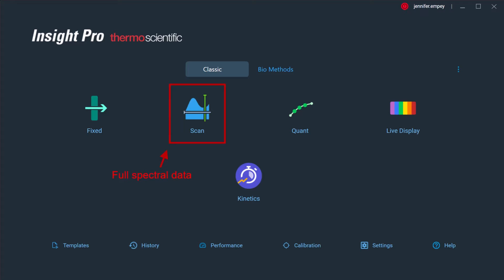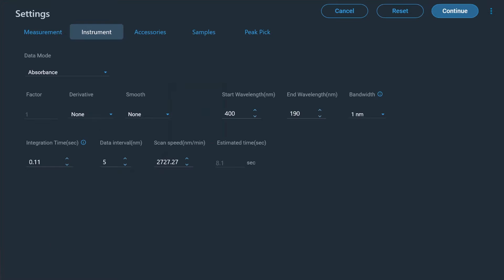The Scan application allows the user to specify a wavelength range by which an absorption or reflectance spectrum can be collected. The measurable range for all Evolution instruments is 190 nanometers to 1100 nanometers. As with the Fixed application, the bandwidth and integration time can be adjusted. In addition, the data interval or scan speed can also be specified if required.